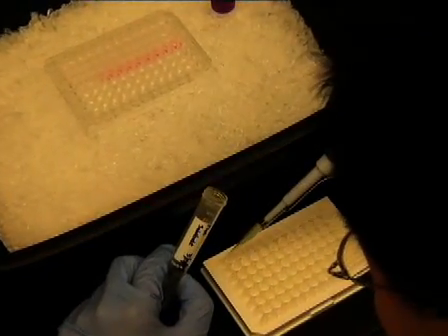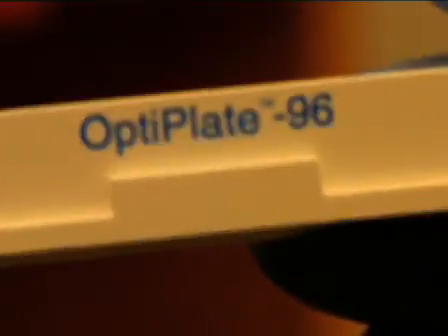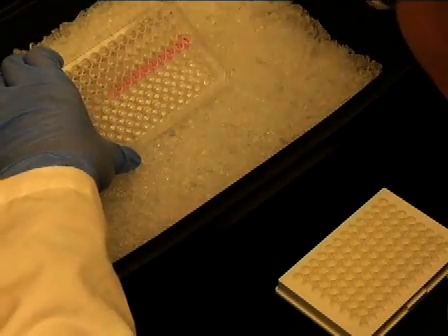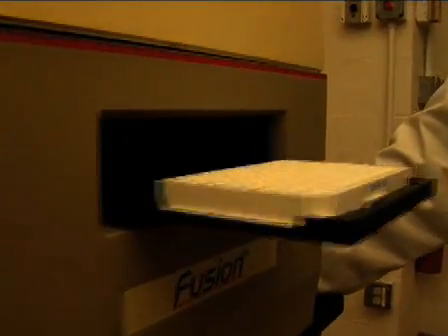Next, aliquot 15 microliters of luciferase reagent per well in a white opaque 96 well plate. We use PerkinElmer's OptiPlate 96. Then add 15 microliters of cell lysate and incubate the plate at room temperature for 10 minutes. After 10 minutes, read the luminescence in a microplate reader.